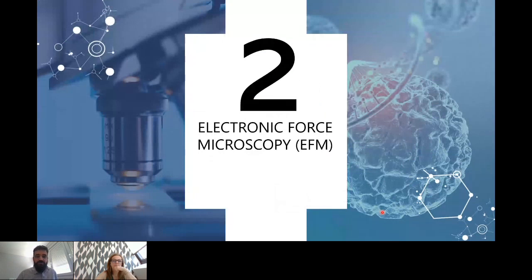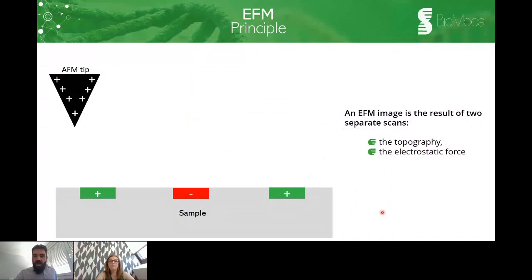Electrostatic force microscopy. So let's jump to the next slide. I will speak about electric mode of AFM.